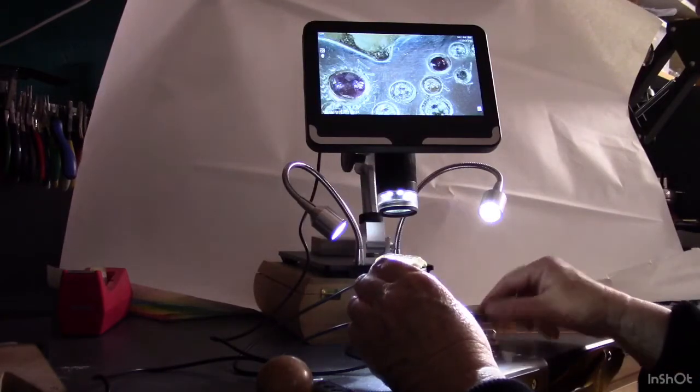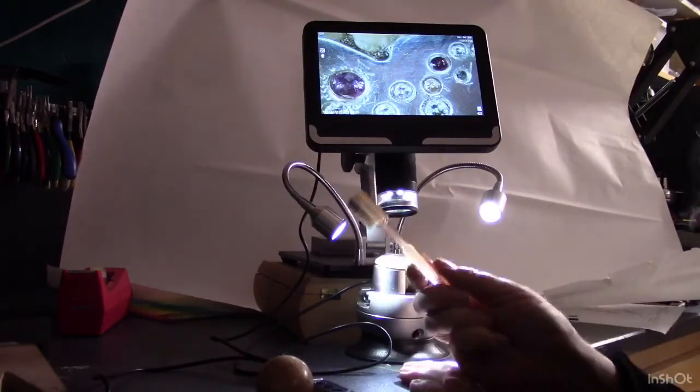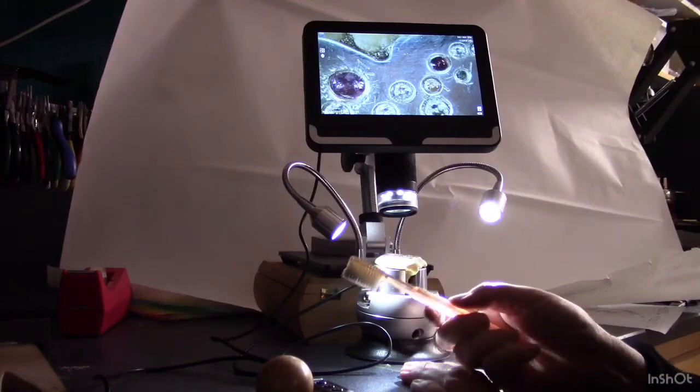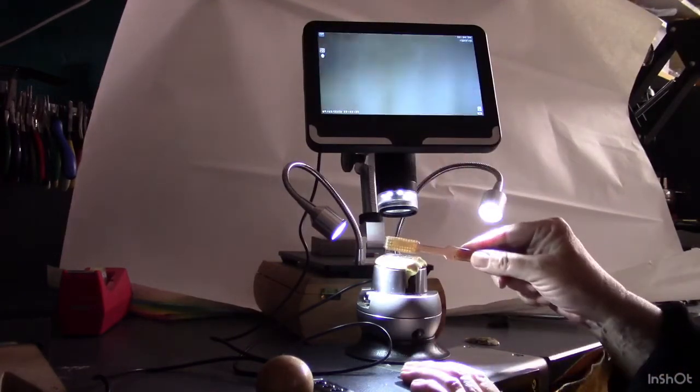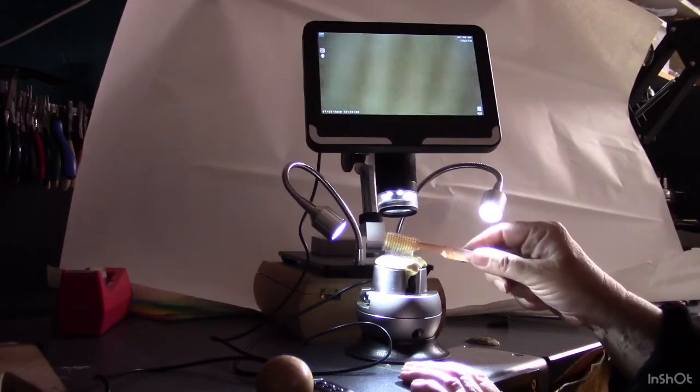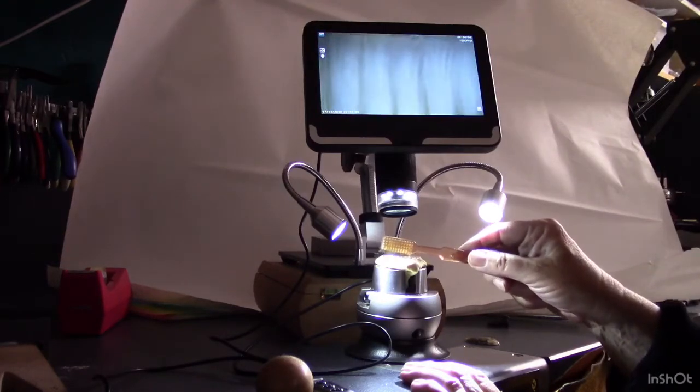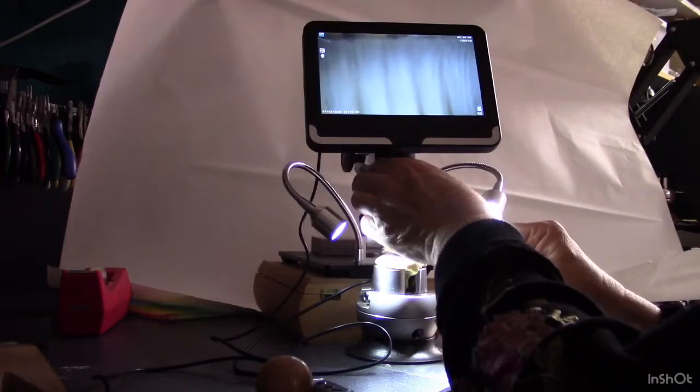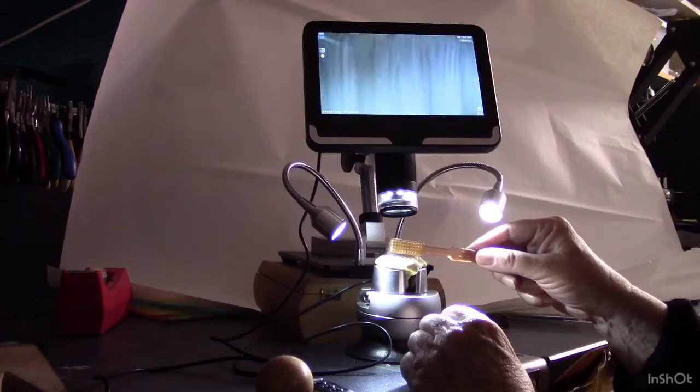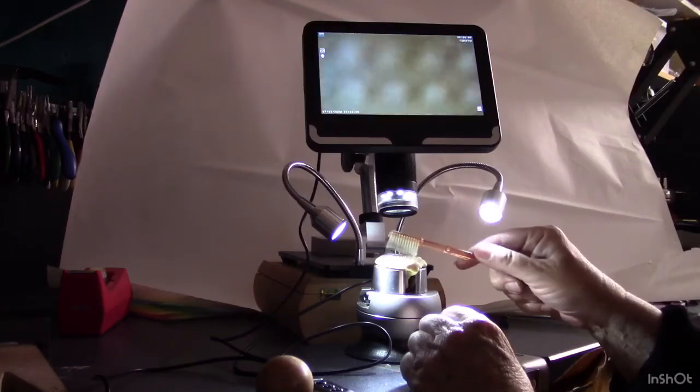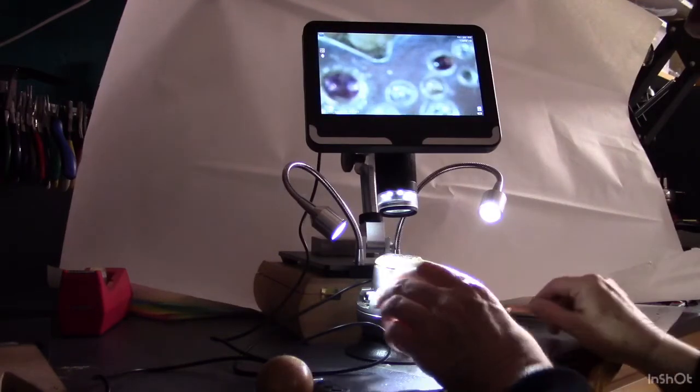You know, so here's a toothbrush right here, right? Watch how big that is when I put it underneath here. Is that astounding? This is like, let me get it in focus for you. That's my toothbrush underneath there. That's how great the magnification is on this thing.